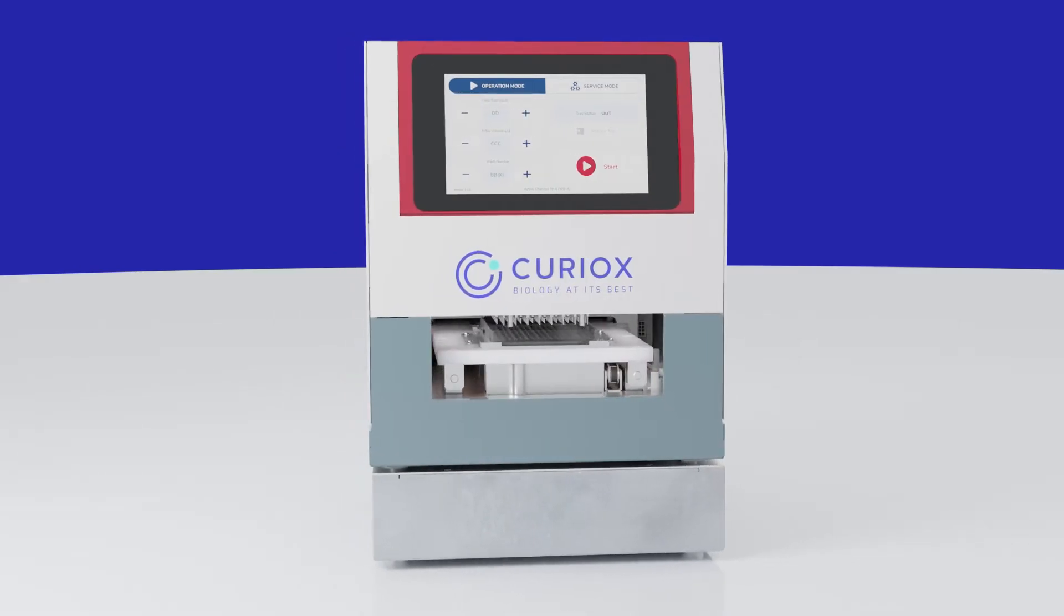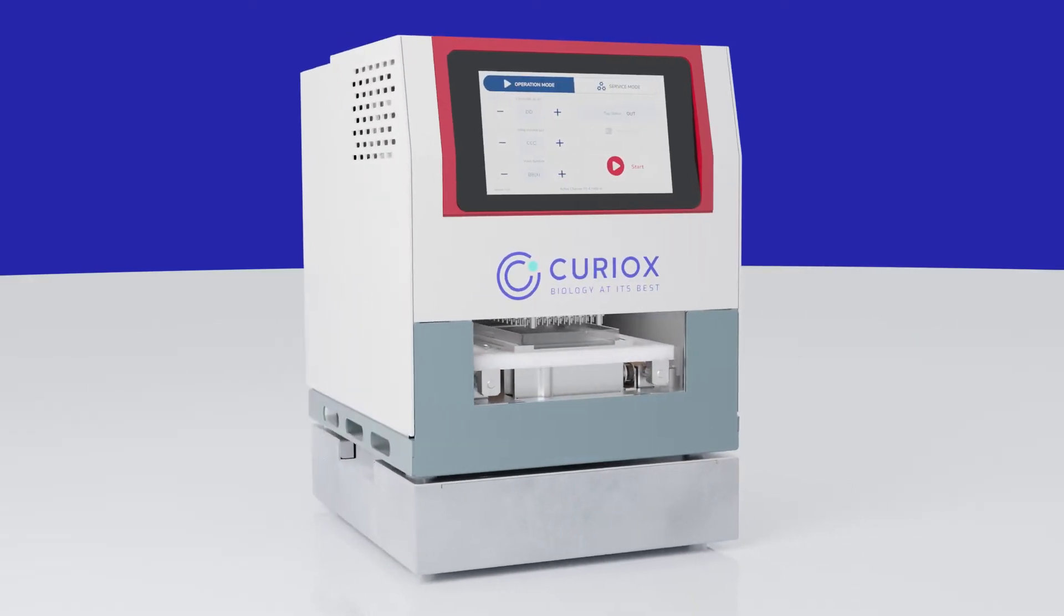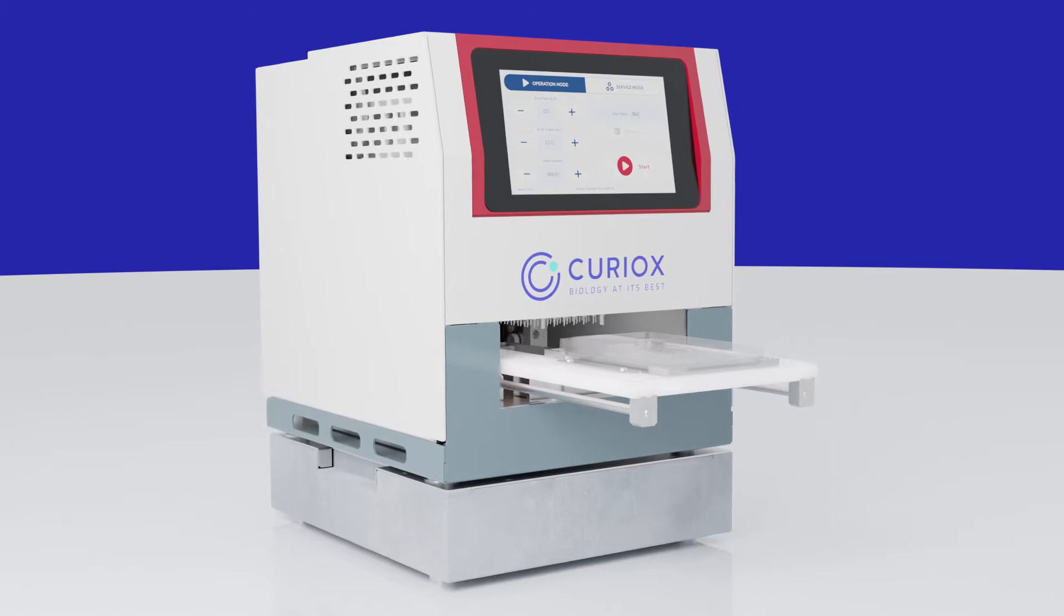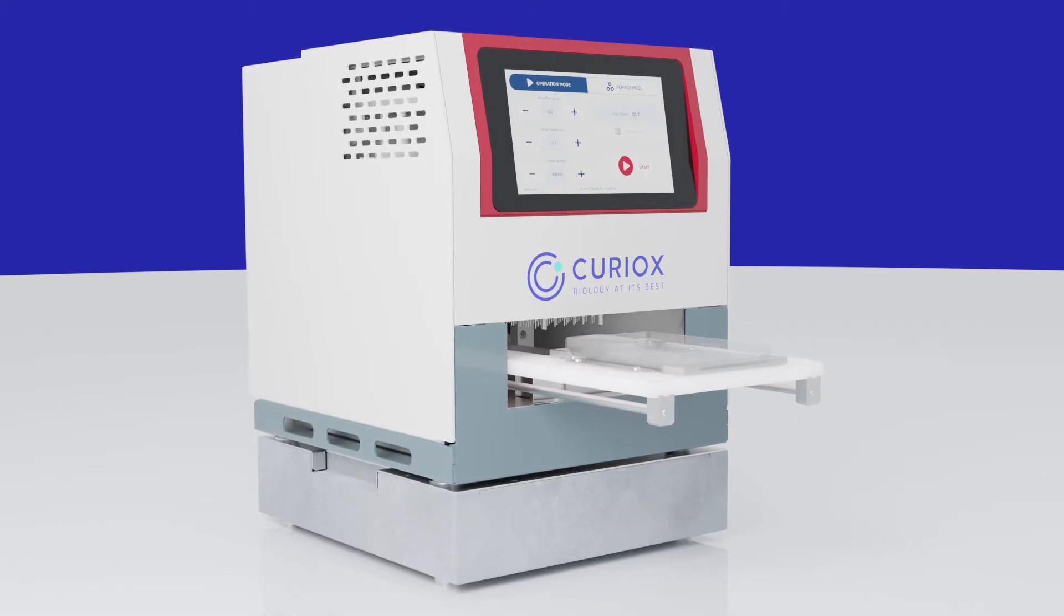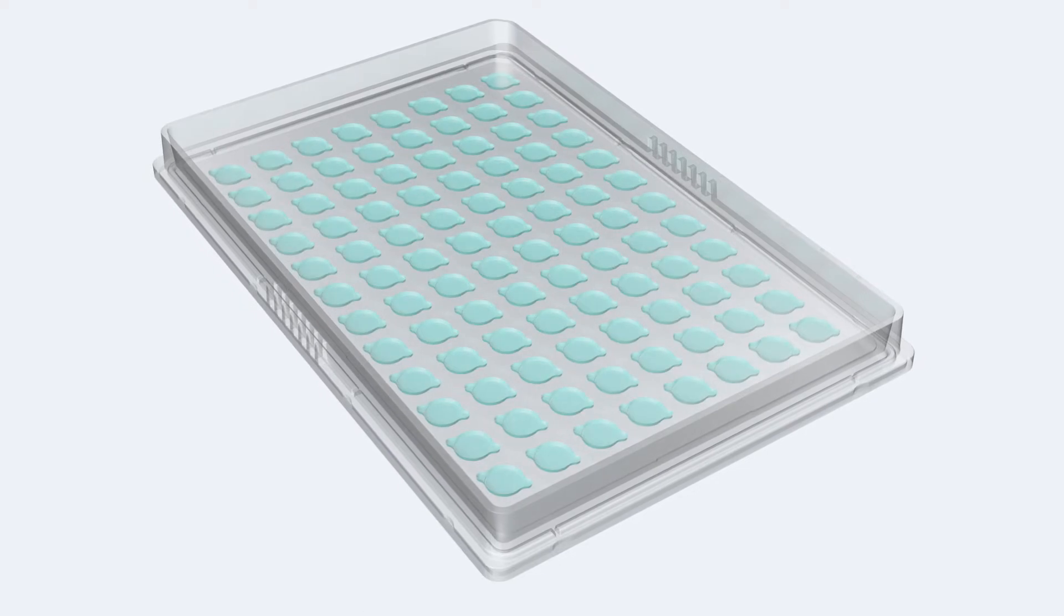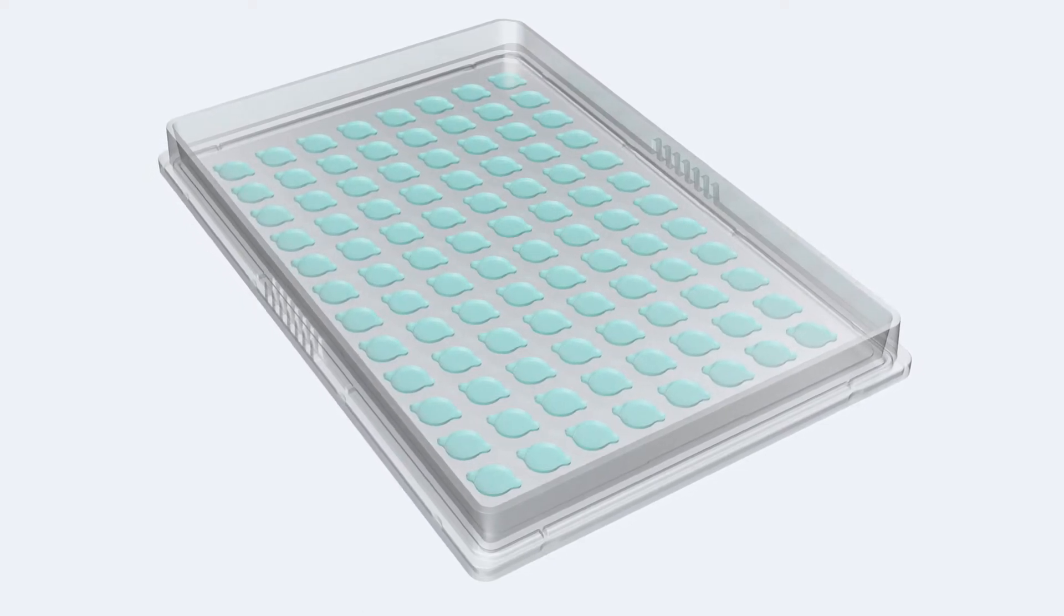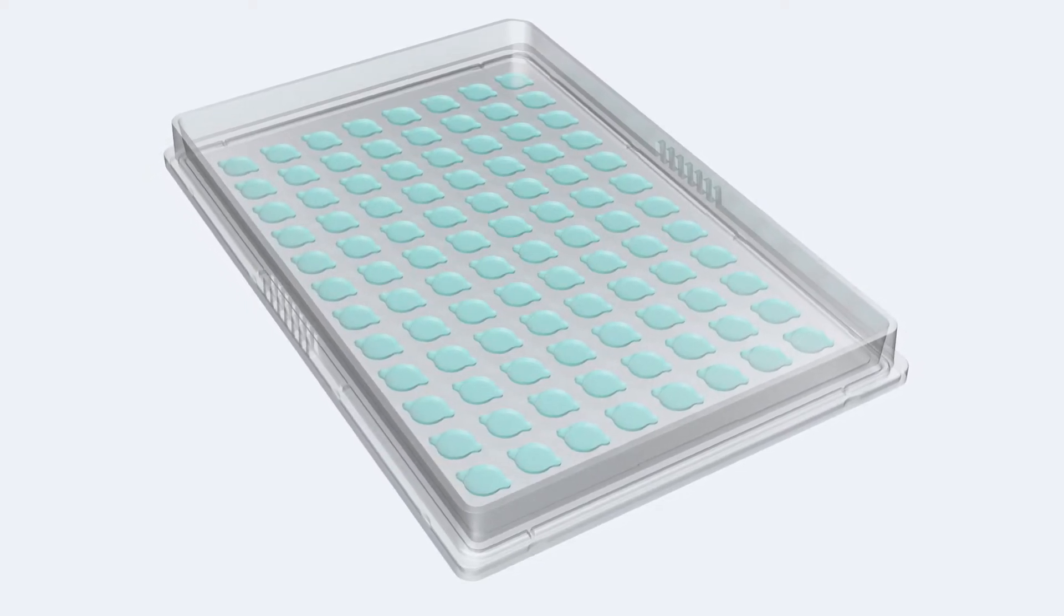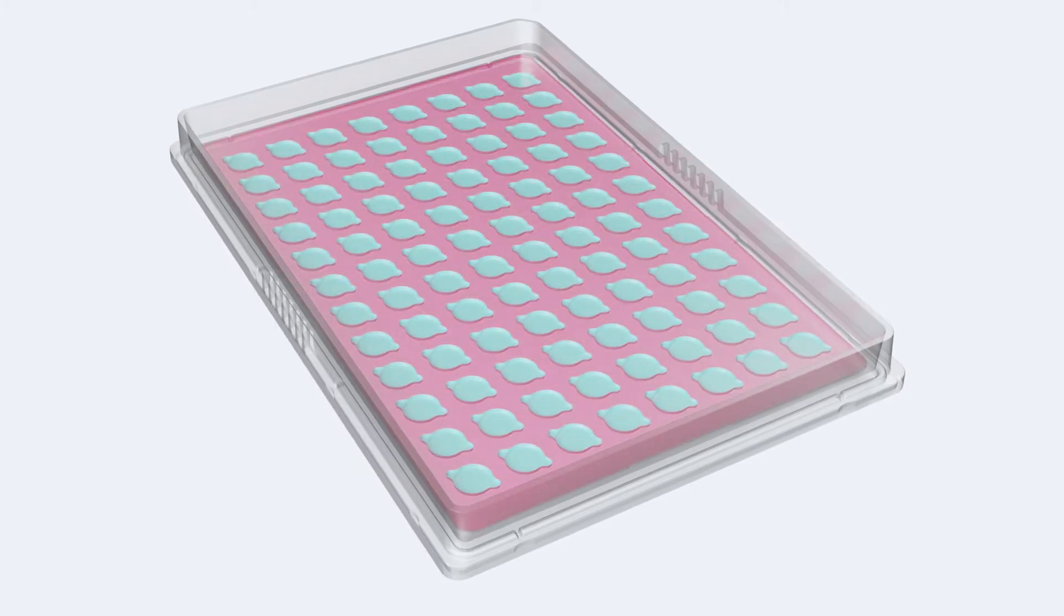The automated laminar wash system by Curiox offers a standardized way to wash cells without centrifugation. Wells on the laminar wash plate have a hydrophilic surface inside low-profile walls, including two smaller satellite areas, and are separated by a proprietary hydrophobic surface.